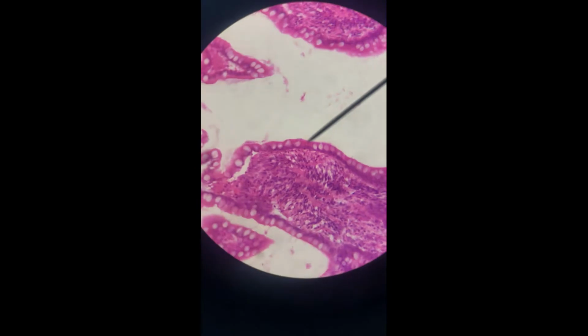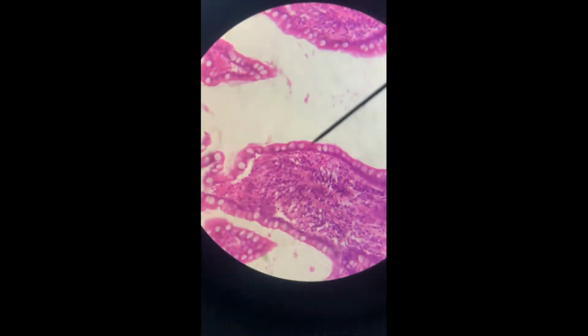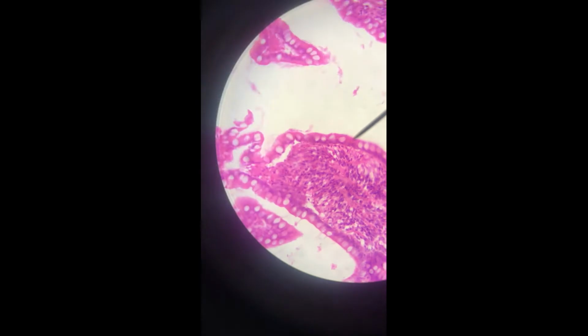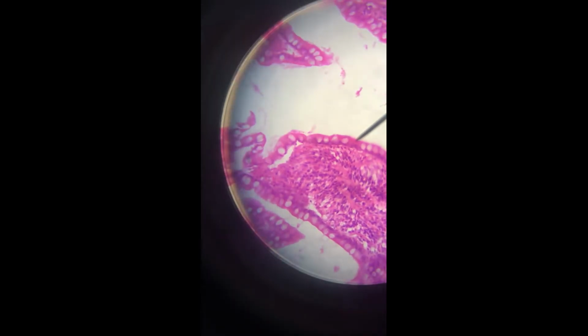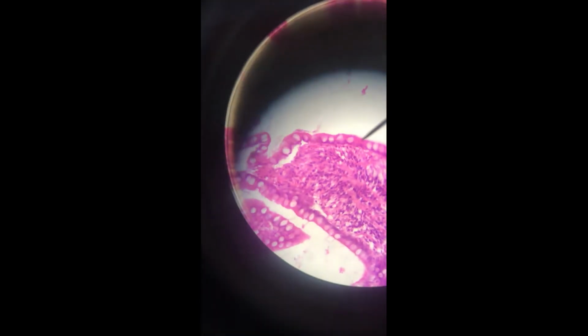On your cell lab, there's a bunch of nonsense about stages of cell division that you should have done in lab in your gen bio class. So all you need to know from the cell lab for our class is the parts of a cell you can recognize. Again, those are the plasma membrane, pointer, plasma membrane, little tiny purple blobs, opposite it, nuclei. All the pink stuff in there, cytoplasm.